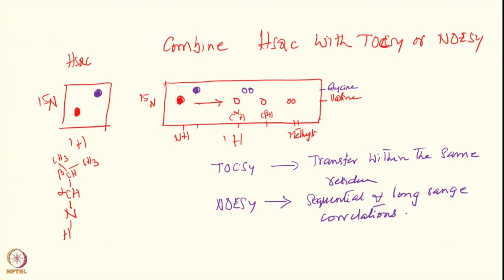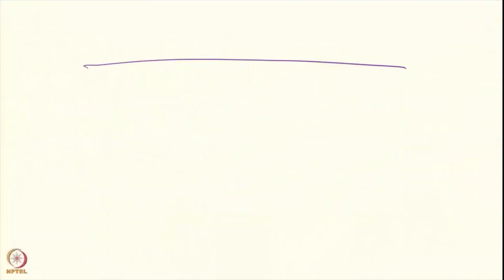Okay. It has also enormous structural information. Okay. So in the next slide I will simply give you the pulse sequence, how it is done. We will not go into the details of that one there, but I will just indicate to you the pulse sequences. Okay. So here I have the HSQC TOCSY. So it starts in the same manner. I have 2 channels here.